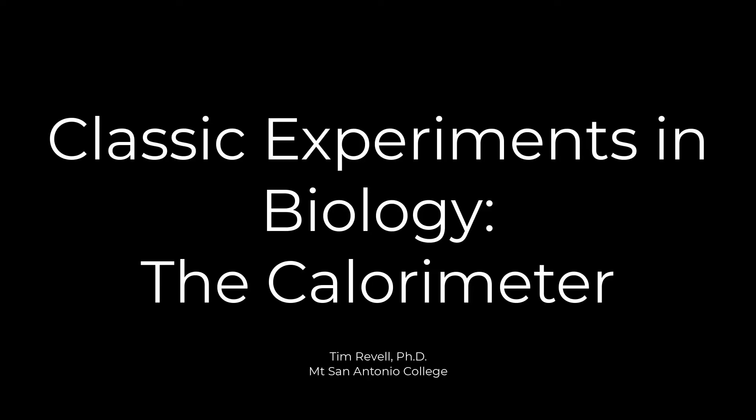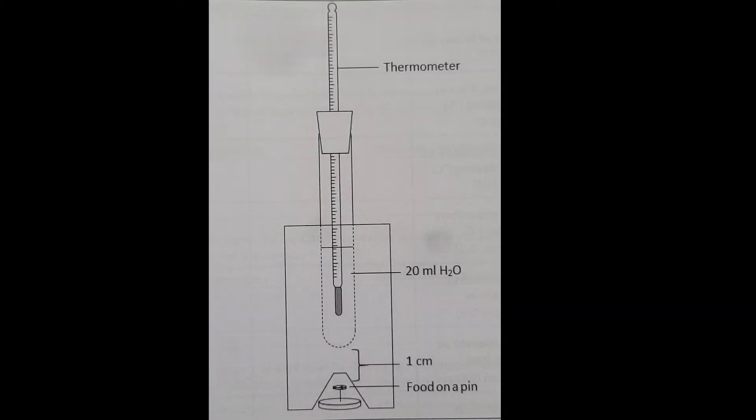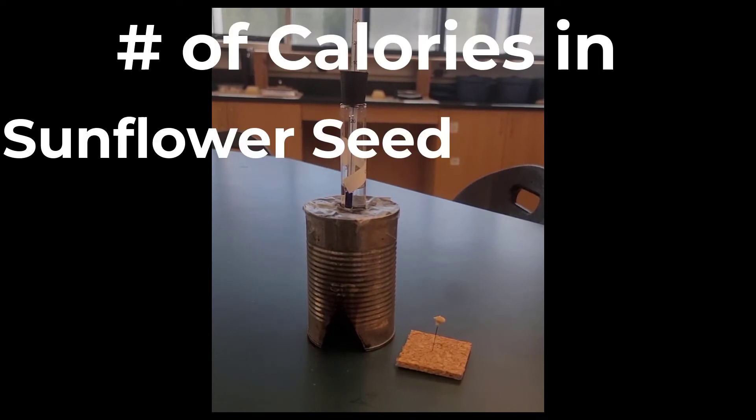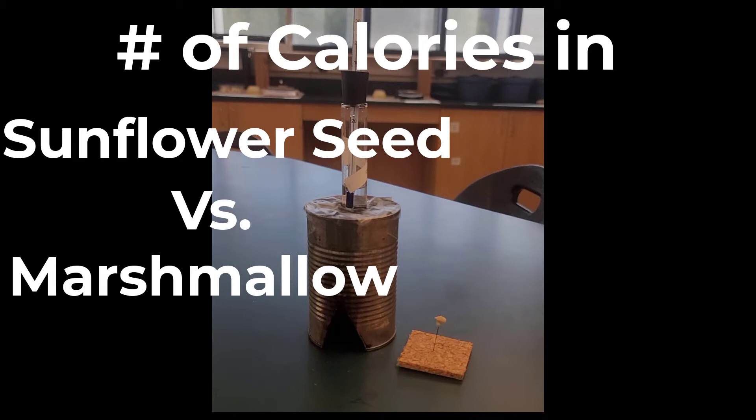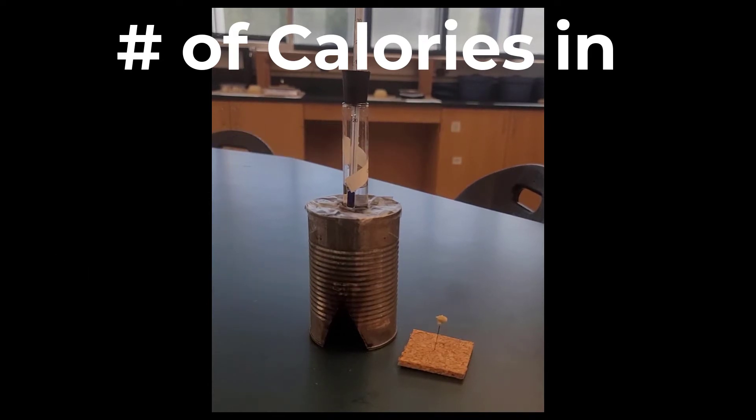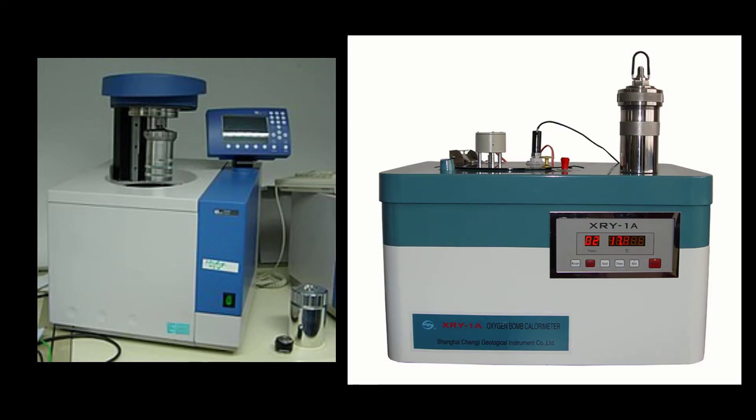All right, hi everybody. Today in this classic biology experiment, we're going to use a calorimeter to determine the number of calories that are in a sunflower seed versus a marshmallow. This type of device is called a calorimeter.